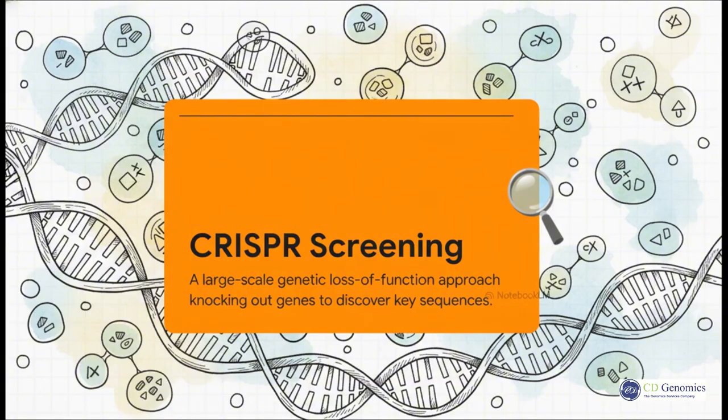Put simply, CRISPR screening is a large-scale genetic loss-of-function approach. So instead of just editing one single gene to see what happens, we generate and screen an entire population of mutant cells at once. The brilliant idea here is to systematically knock out every single gene in the genome that could potentially be important. But, and this is absolutely crucial, only one gene per cell. It's like a massive, parallel investigation into genetic function.